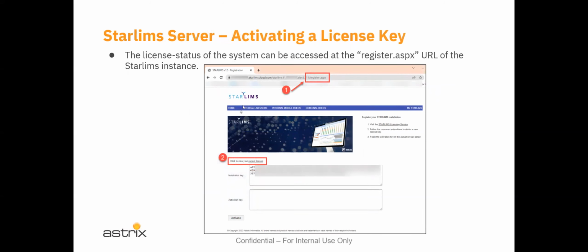The next step you might want to know about is the actual licensing structure for a given STARLIMS system. And we'll use just one at this point, for example, the development environment. When a brand new system is installed in STARLIMS, it comes with a 2 license installation, allowing 2 users to come in and one to define additional users that may need to use the system. However, only 2 at a time can use the system.